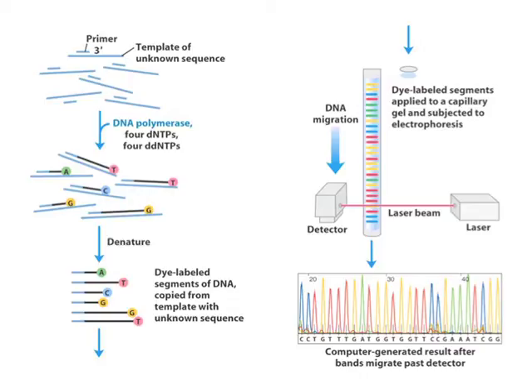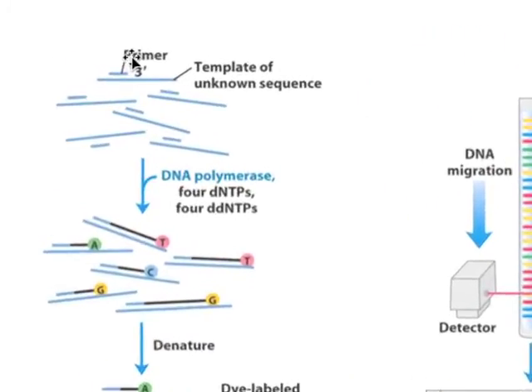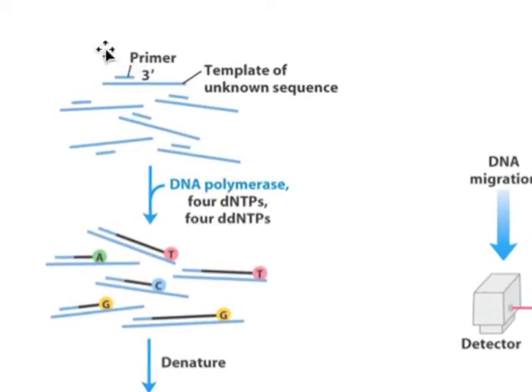Now, having said that, it's also to be recognized that even today, in 2010, there are more advanced techniques that have been developed and are used, but this is a pretty standard technique, and when we do our DNA sequencing in lab, we will actually obtain data that was done via a method very similar to what I'm going to describe here.